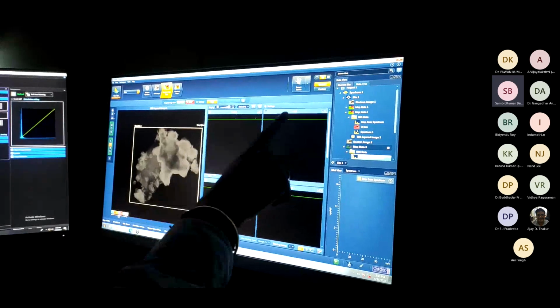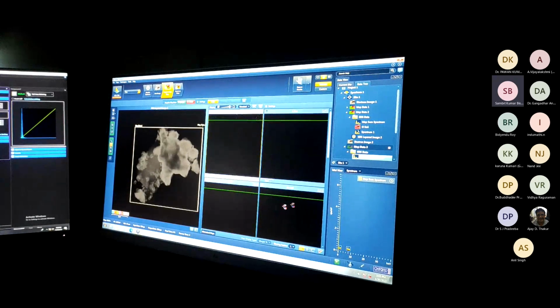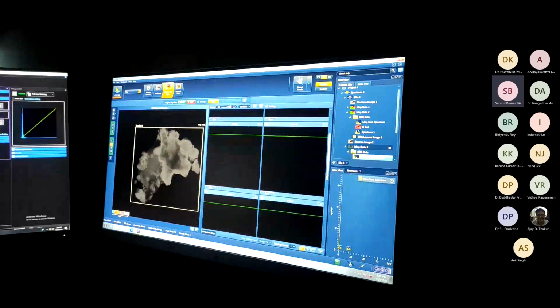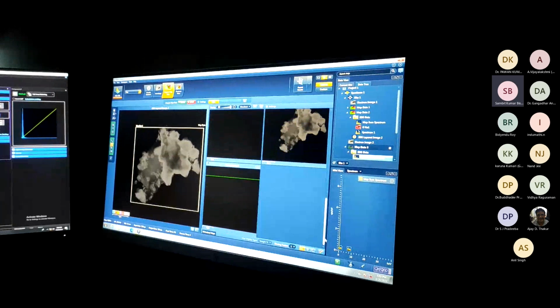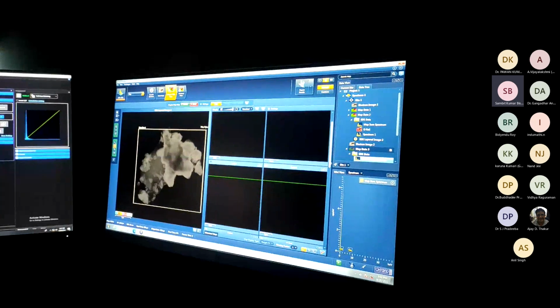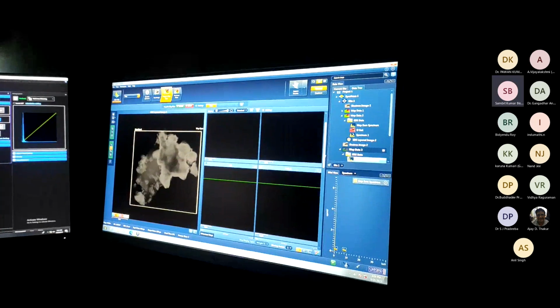So this one is copper. This is sulfur, fluorine, Cl, Au. A variety of elements are coming, but our interest is in gold and silver, oxygen, fluorine.